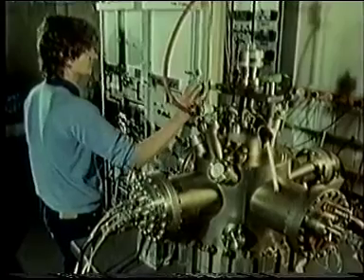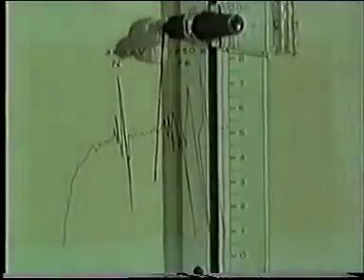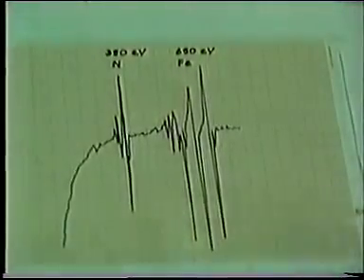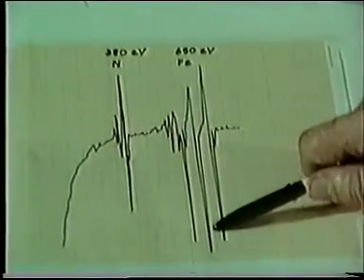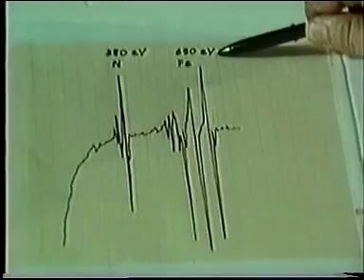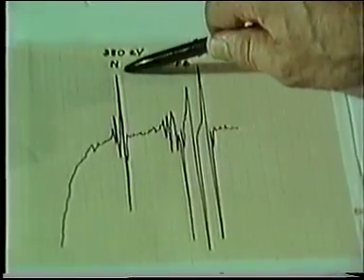Now we can run the Auger spectrum of the nitrogen-saturated iron 100 surface. Here's the spectrum. These signals up here come from iron. I'm going to concentrate on the middle one at 650 electron volts. Down here at 380, we have a signal from nitrogen.